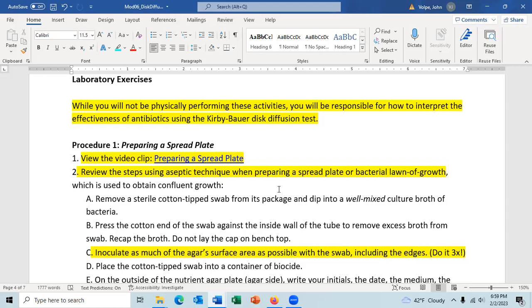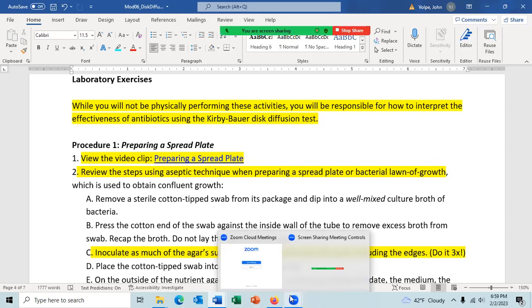And then you take the swab and then you inoculate the surface of the agar plate everywhere on the plate. It would be better if it was round so it shows a little better. You have to be careful because this has water in it. I don't know if you can see this, but you're swabbing everywhere. Okay? Can you see this?